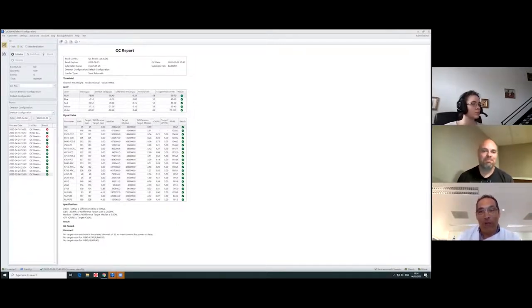So the first one I will go through is this QC. To be honest, it's super fast in this instrument. Some others might take a little bit longer. Some softwares do this QC for you. Others you have to type and write and do the mathematical calculation afterwards. In this case, we are lucky. It does everything for us really quickly. So this is the first control I will run.